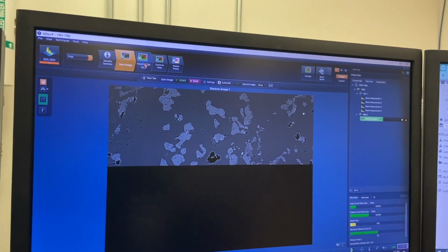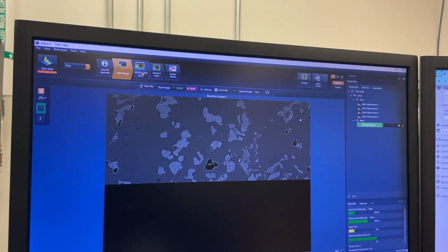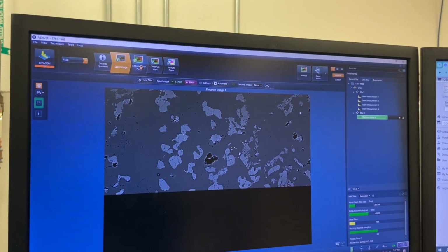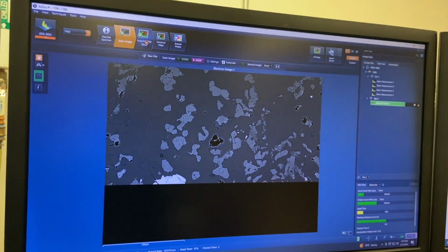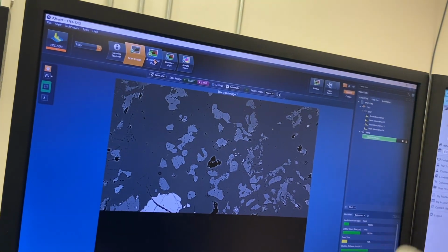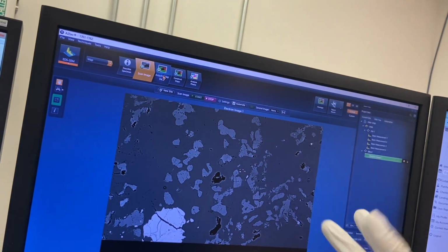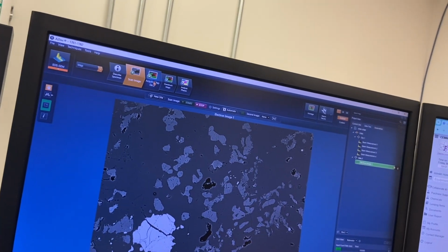So where's my magnesium? Where's my silicon? Where's my iron? Where's my calcium? Where's my titanium? Stuff like that. Mineral phases are essentially minerals by definition. If you want to view them as mixtures of elements in different quantities, you could do that, although minerals have very specific definitions and 5 main criteria for those. But essentially, the elements are distributed differently in different mineral phases. The proportions of the elements in mineral phases are going to reflect the intensities of those X-rays. Therefore, you're going to get a variety of colors for your mineral phases.